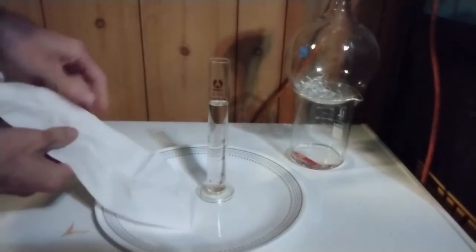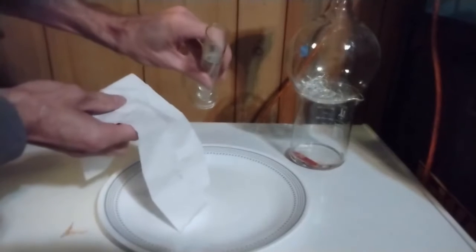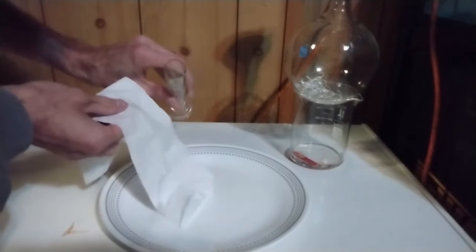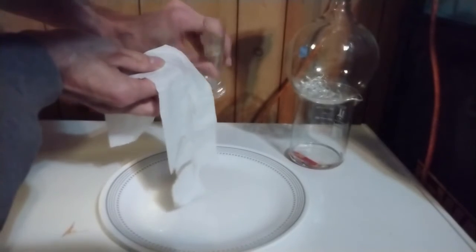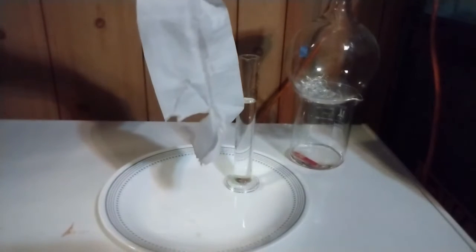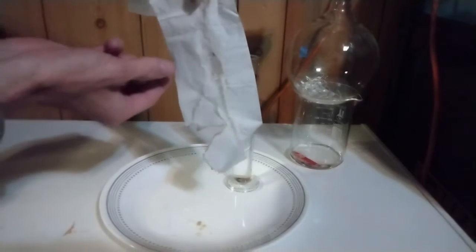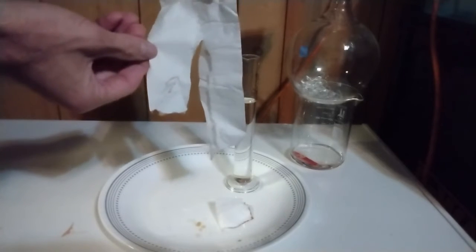For the third test, let's see how it reacts with a napkin. I'll pour a few drops — and yes, you can see how the napkin is getting eaten away. This is typical behavior with concentrated sulfuric acid.